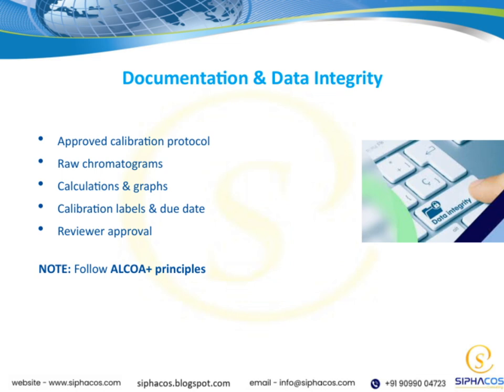Remember, following ALCOA Plus principles: attributable, legible, contemporaneous, original, accurate, plus complete, consistent, and enduring. These points help us uphold the integrity and trustworthiness of our data throughout the analytical process.